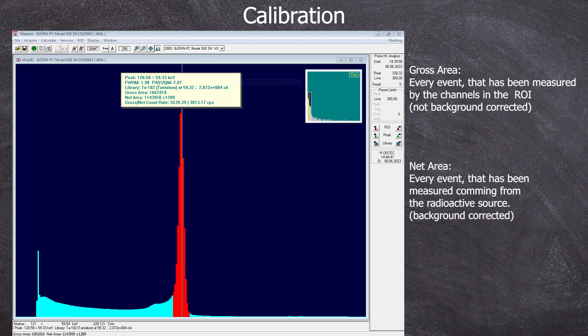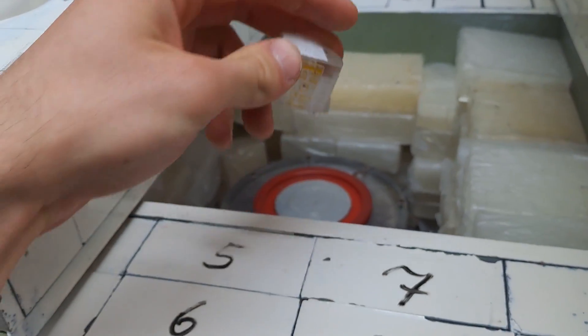For gamma radiation, there is always a background and in this case, it's automatically been subtracted. So net area includes only the gamma rays that are emitted by our samples. Or you can make things easier by just directly noting the CPS of the net area, which will come in handy later in our calculations. CPS stands for counts per second. In America, you mostly use counts per minute, but that's just a factor of 60.